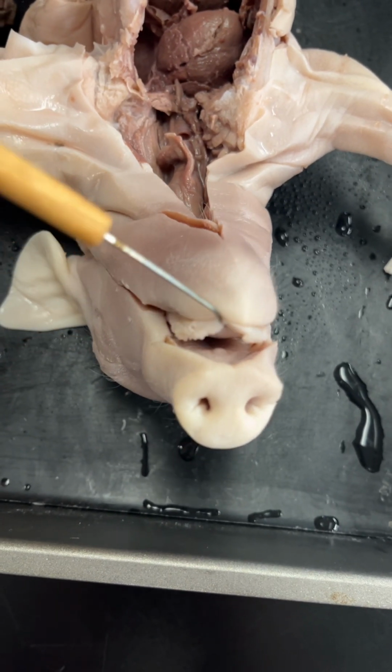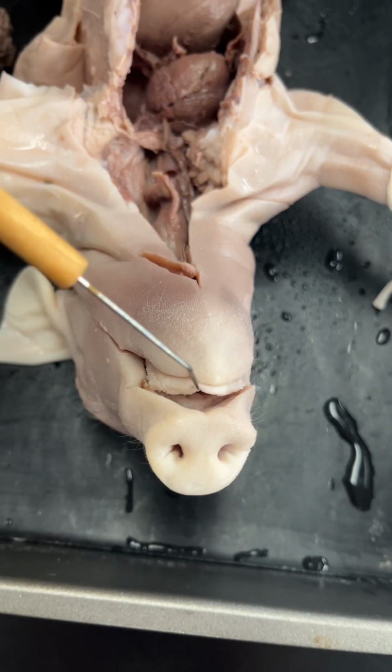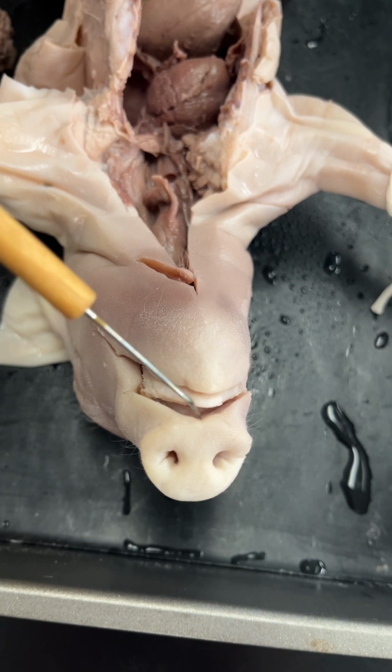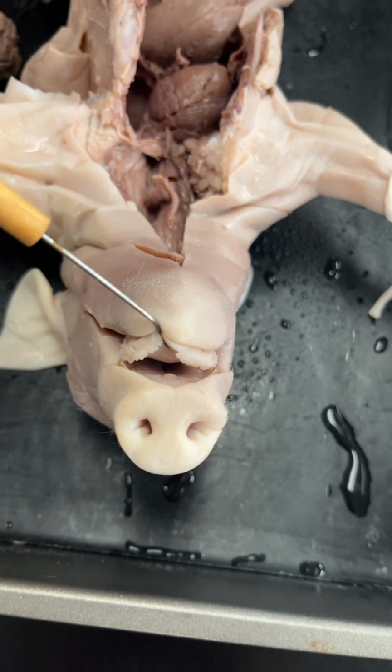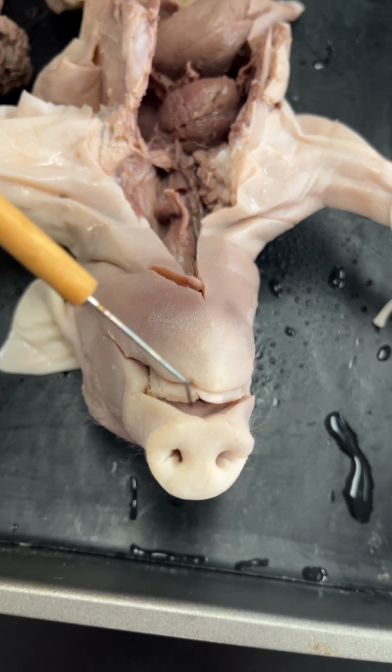This is the tongue. The tongue is attached posteriorly and free anteriorly. Locate the papilla on its surface, especially near the base of the tongue and along its anterior margins. The function of the tongue is to move food into the esophagus and into the stomach for digestion.